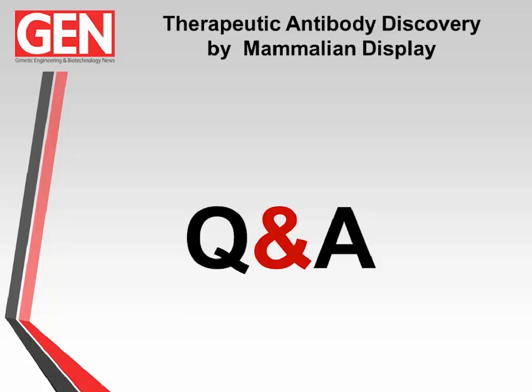Okay, so the problem to solve is how to make big libraries in mammalian cells with a single antibody gene per cell. And a number of companies and labs have taken different approaches to solving that problem. We have taken the approach of targeting all of the genes into a single locus in the cell. And we think that this transcriptional normalization that we achieve makes for cleaner results, particularly when it comes to looking at the level of expression and or the developability comparisons.